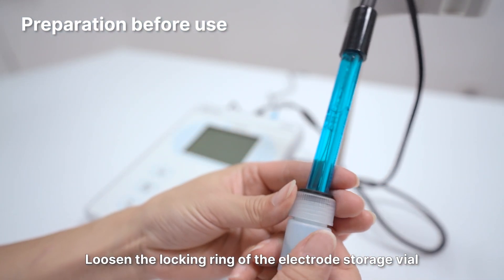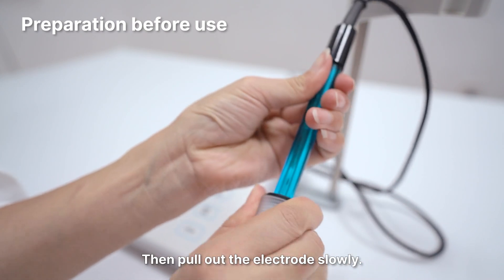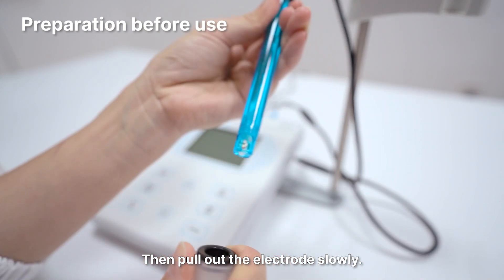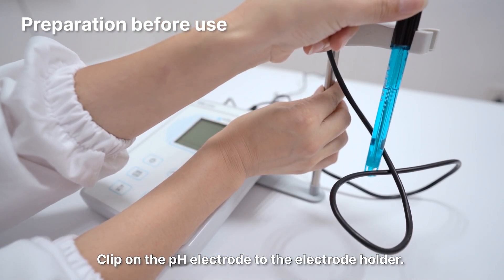Loosen the locking ring of the electrode storage vial by twisting it counterclockwise. Then pull out the electrode slowly. Clip the pH electrode onto the electrode holder.